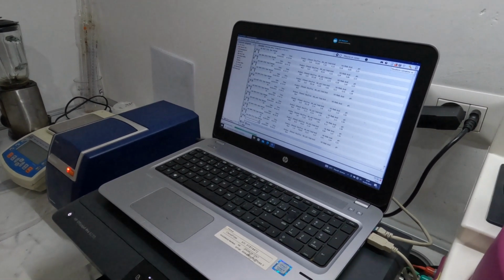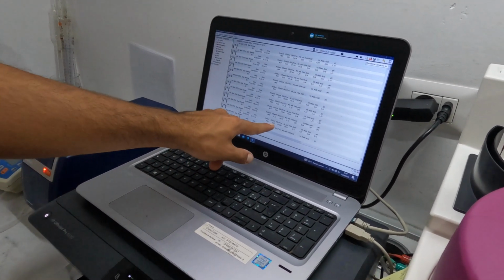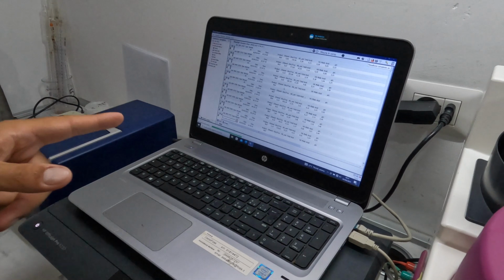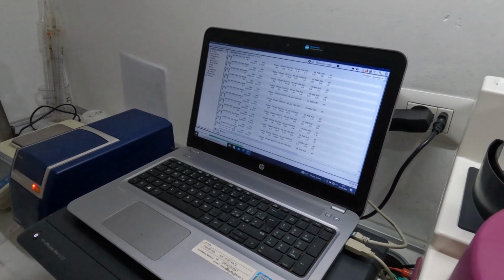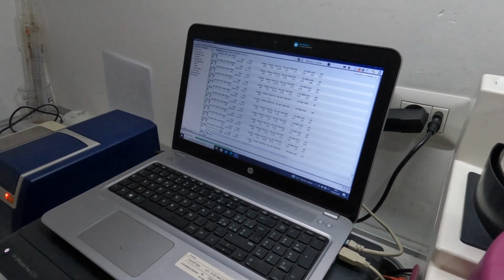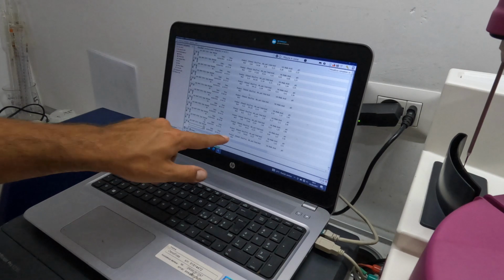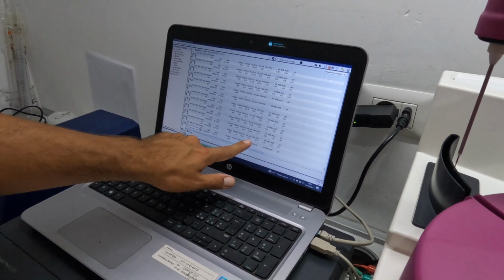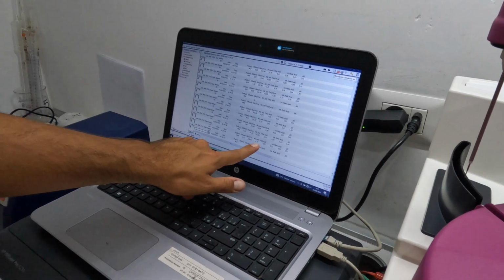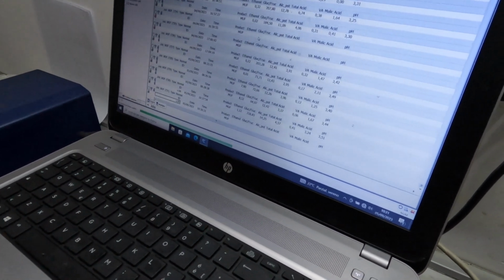Gotcha. So, for example, in tank 68, you have 1.12 of alcohol, so it's the start of fermentation. The sugar is very high. Okay. This is the potential alcohol. So this is the alcohol it will end up with, right?